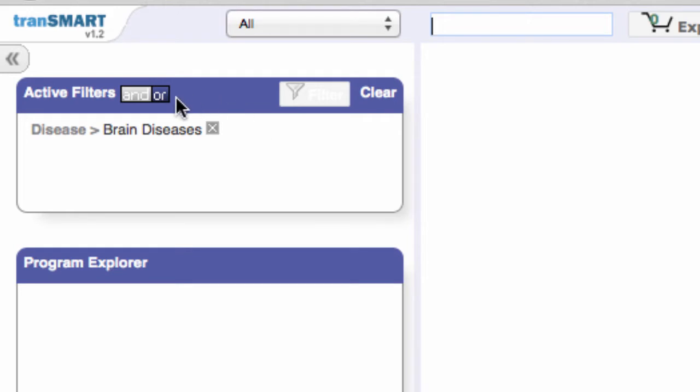You can toggle between AND and OR as you build a more complex search to suit your needs.